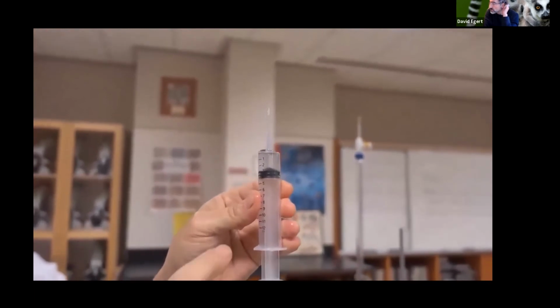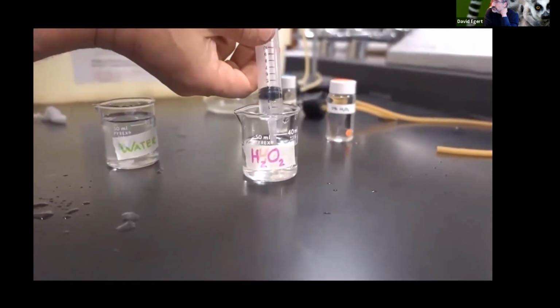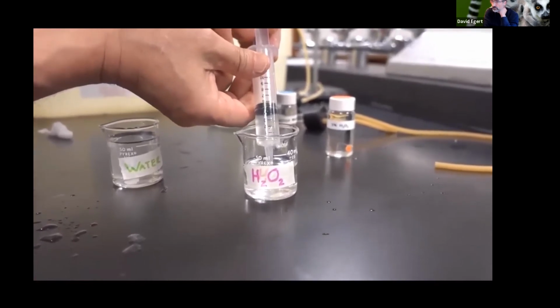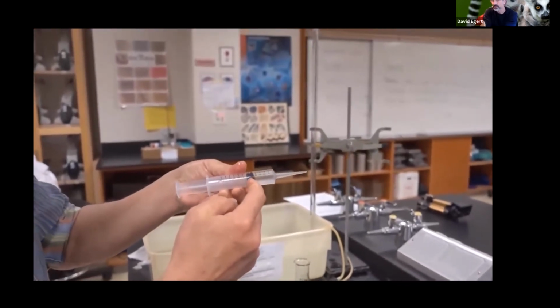And then for the hydrogen peroxide, the 2 mils, we just have to dip the nose into the hydrogen peroxide here and continue sucking up until I get exactly to 5 mils on my marking. And there I go. So there is 5 mils of liquid in here, 2 of the hydrogen peroxide, 3 of the water.